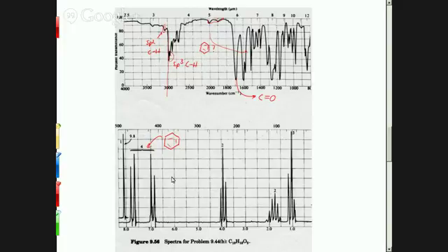The more information we get is from the integration. Can you all read that number? It's 4. So what does it tell us that the aromatic hydrogens, the hydrogens on that benzene ring, integrate to 4? It's telling us that that all is one group together of 4. We'll talk about why that is. So it tells us that there are 4 hydrogens from this ring.